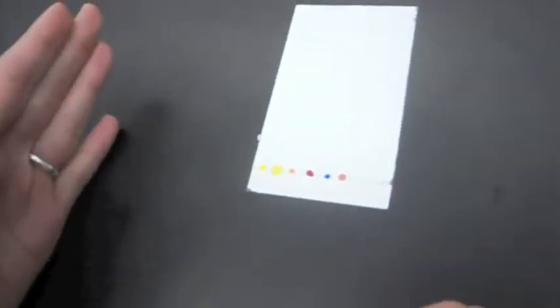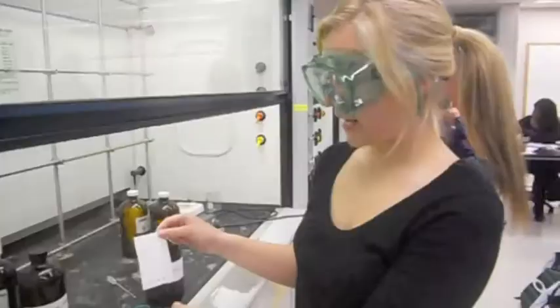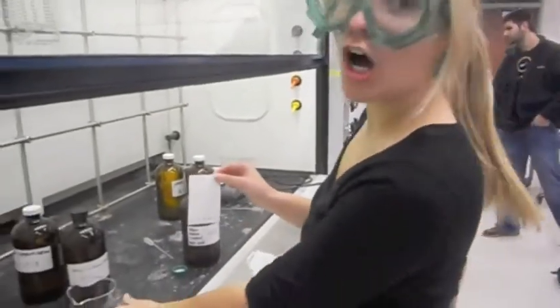Once you have all your dots, you need to place it in the solution that does not come up to the top. In the fume hood, place the solvent in a beaker.